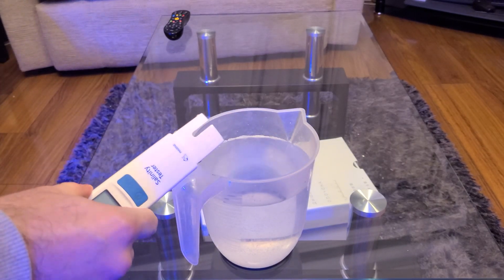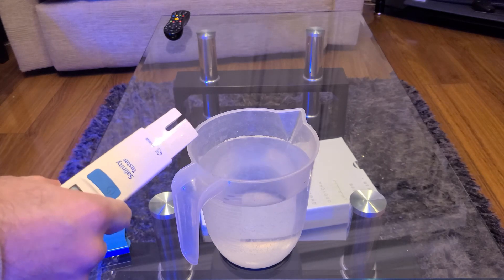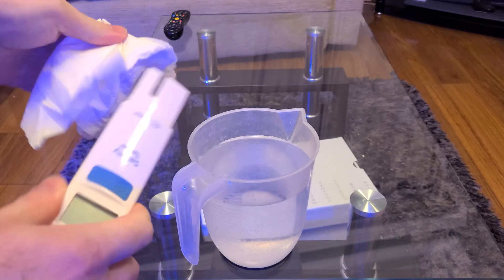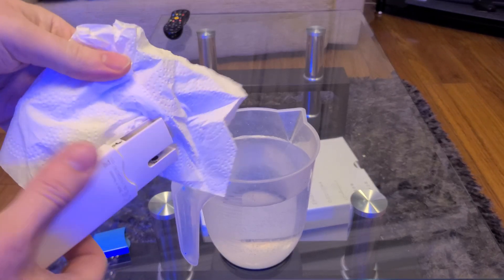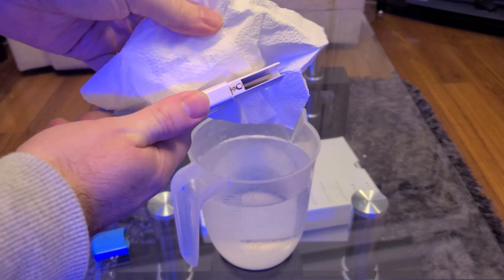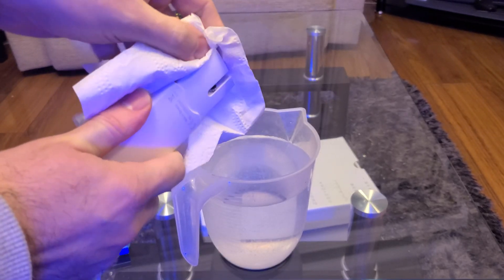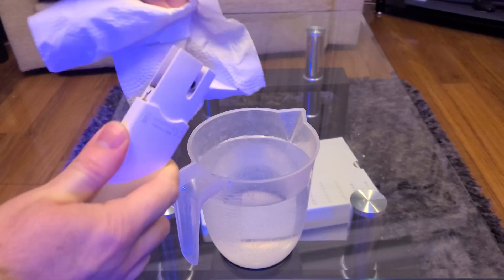What you then want to do is thoroughly dry the device. You want to make sure that you get into every nook and cranny and get rid of any drops of RO water that could potentially dilute your calibration fluid, which again would affect the accuracy of your calibration.